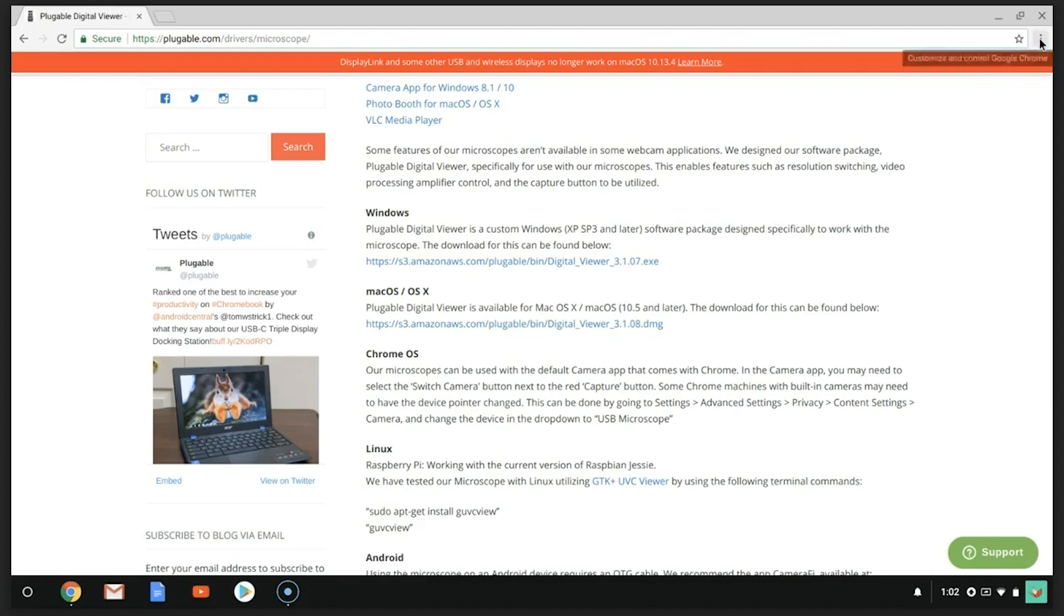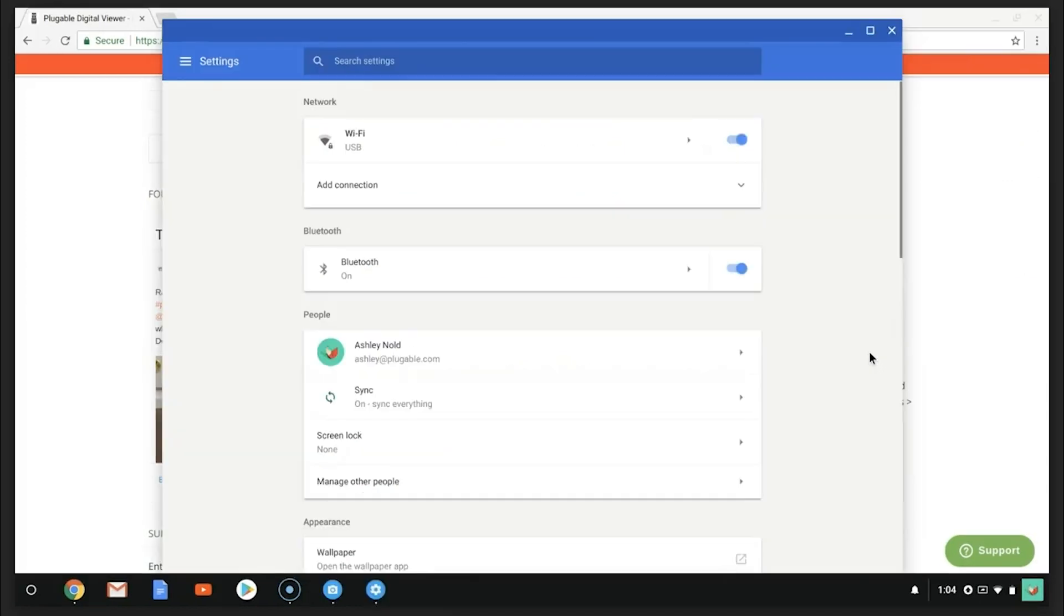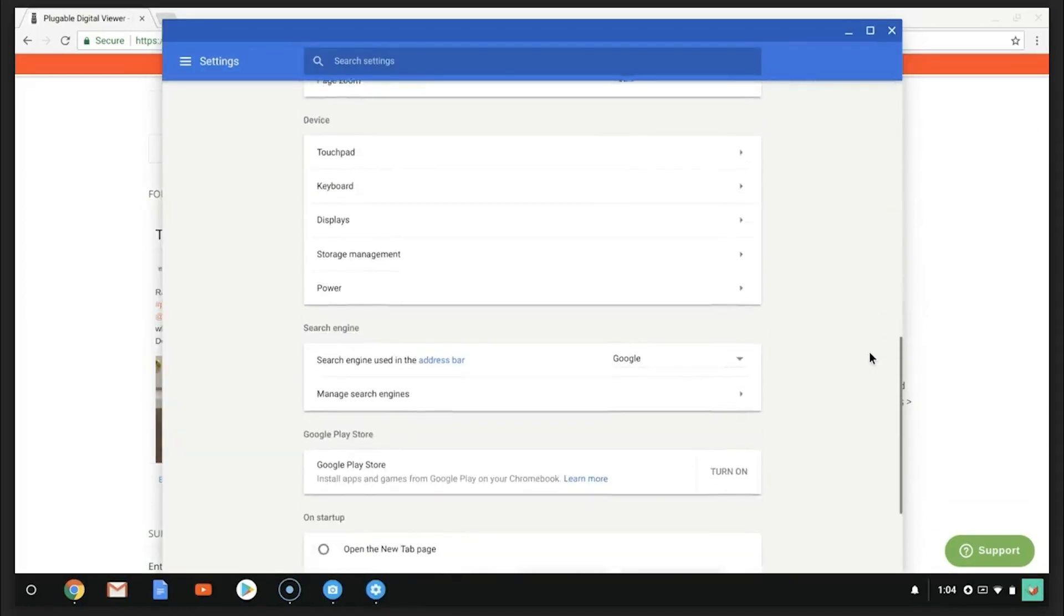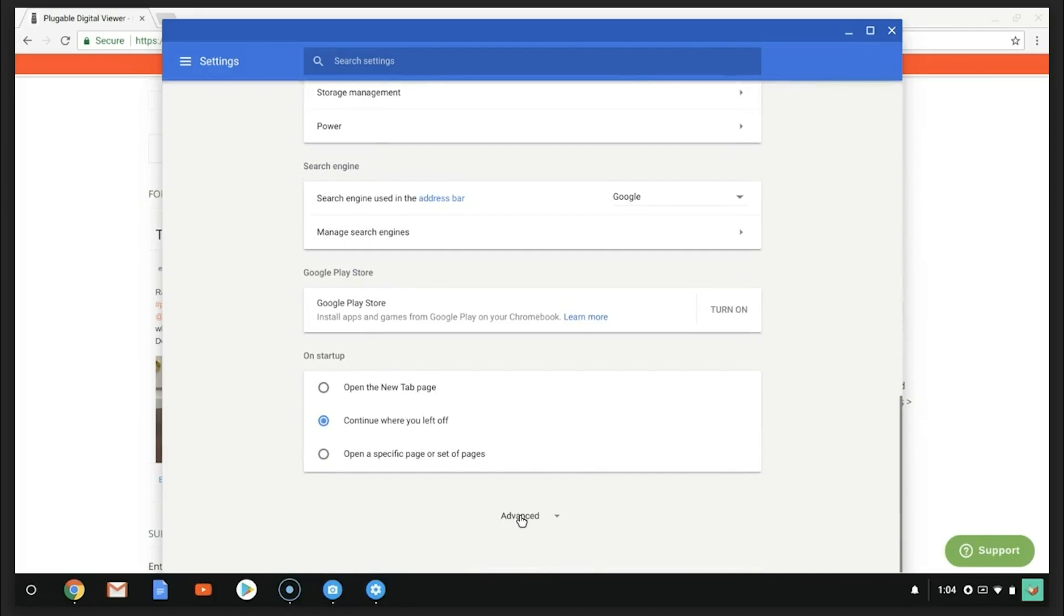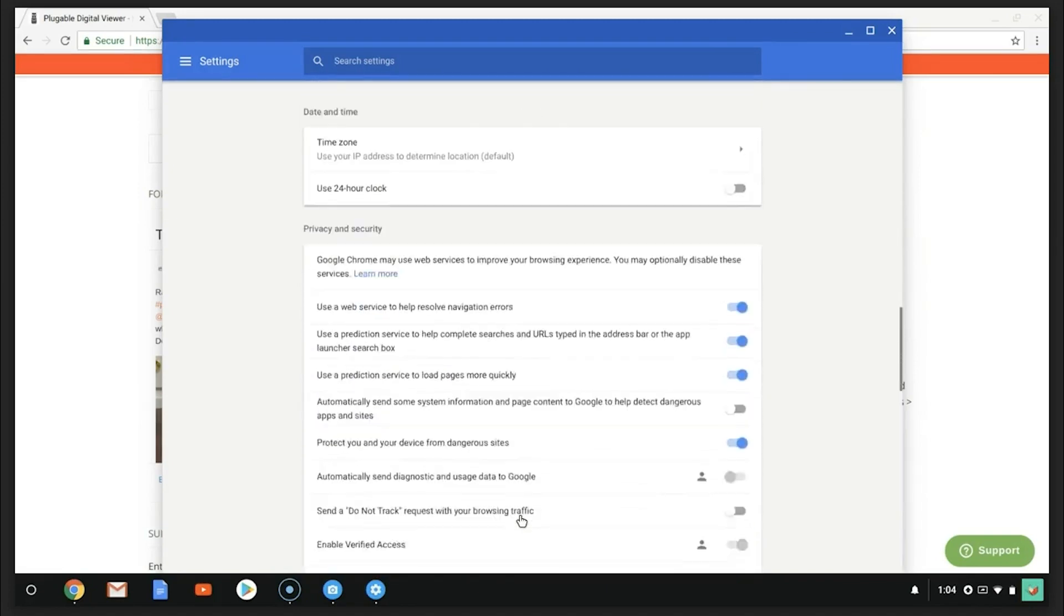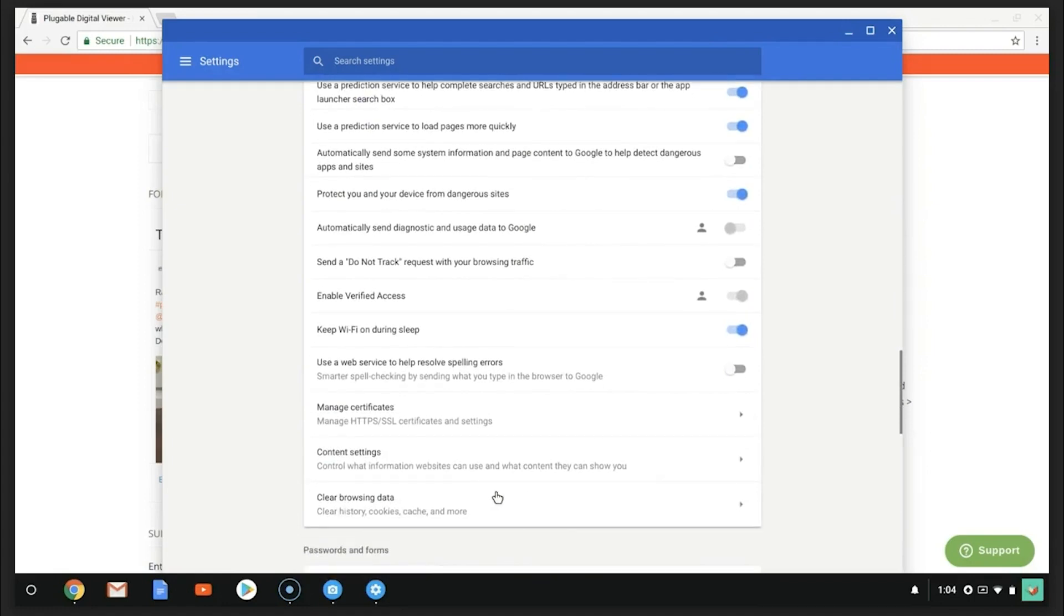First, access your settings. Scroll down to Advanced Settings. In the Privacy and Security section, click on Content Settings.